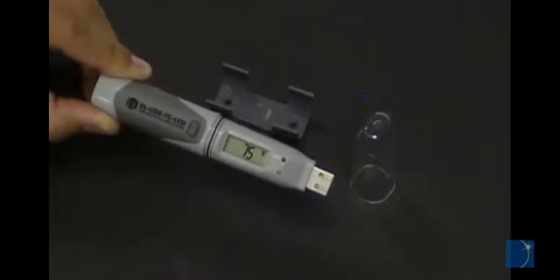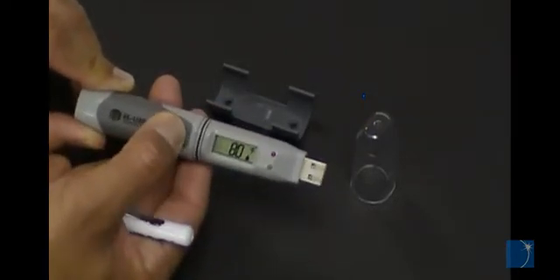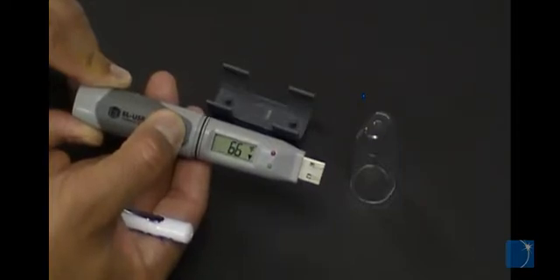Those with a LCD display include a push button that can be used to cycle through minimum and maximum values or to start recording.